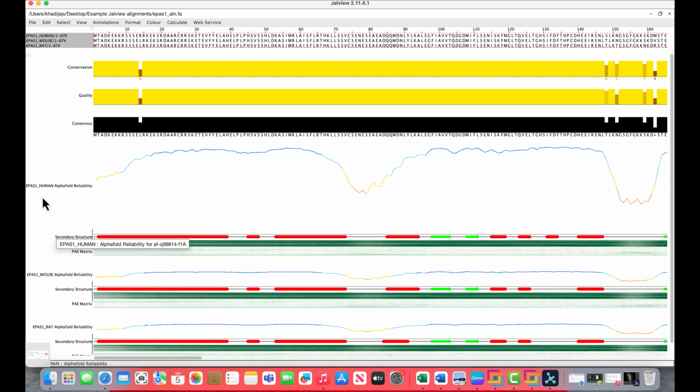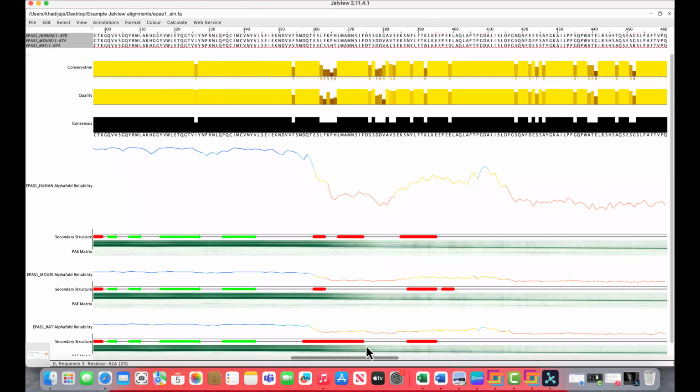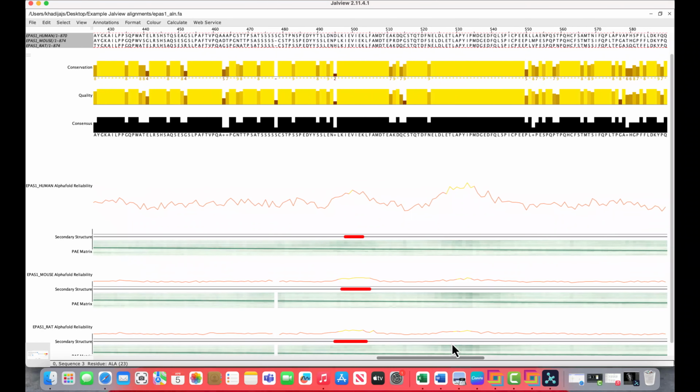So in this predicted model, we seem to be doing well initially. There's high pLDDT scores, lots of blues, until we scroll to the right. And now we'll encounter a lot of orange dips in the model's overall quality, indicating that the scores are below 50%.